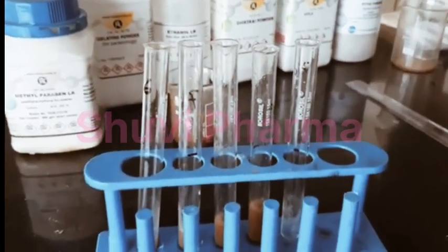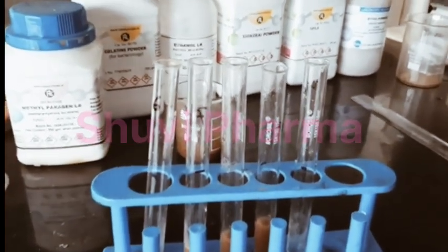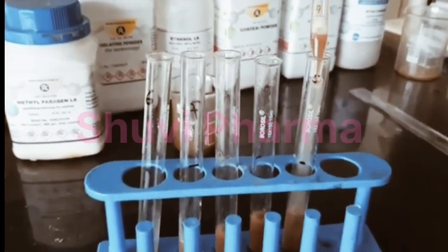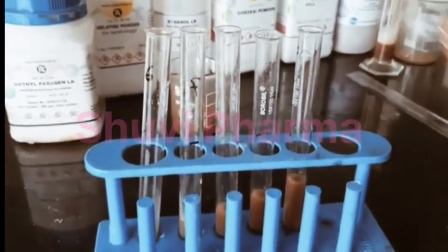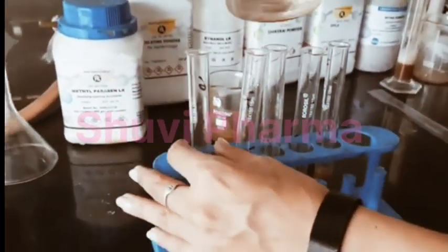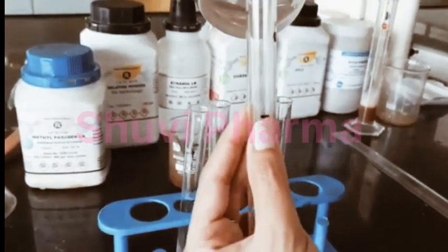In the last test tube, we will take 5 ml. Now we will shake these test tubes. Now we will add water up to 10 ml, up to the mark I have already made. Then we will shake the test tubes.